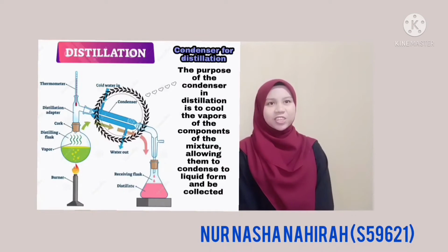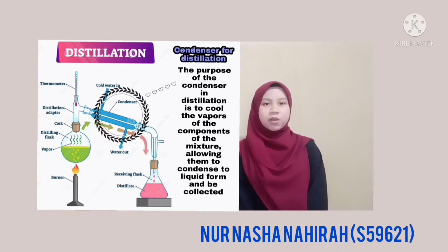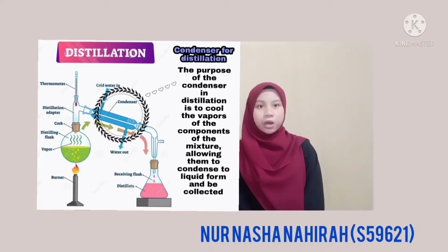Condenser for distillation. In a distillation, liquid compounds can be separated from one another based on differences in boiling points of the liquids in the mixture. The purpose of the condenser is to cool the vapor of the components of the mixture, allowing them to condense to liquid form and be collected.